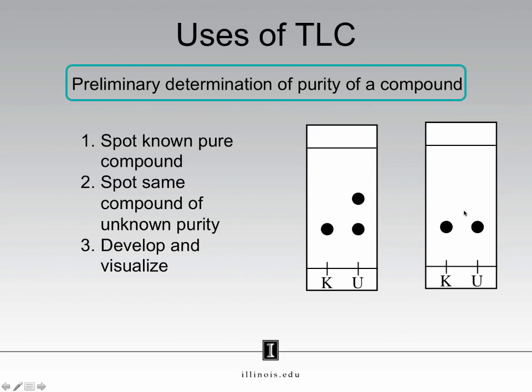Why am I saying probably? It is possible, albeit unlikely, to have an impurity with the same retention factor as the compound. In other words, it is possible that there are multiple spots overlapping together. Such a situation is unlikely, but it must always be considered.